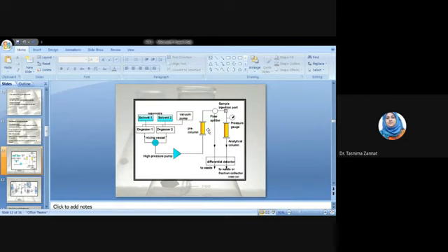Here pre-column is one type of column which can remove impurities or check the quality of the solvent, so that the pure solvent may go from here. This pre-column actually guards the analytical column, because the analytical column is called the heart of the HPLC instrumentation.